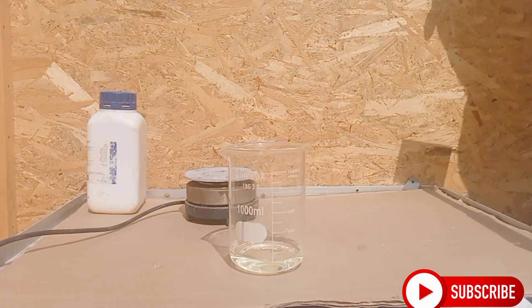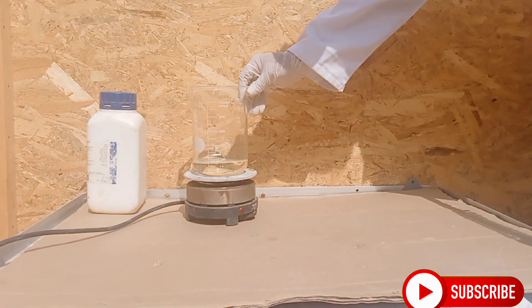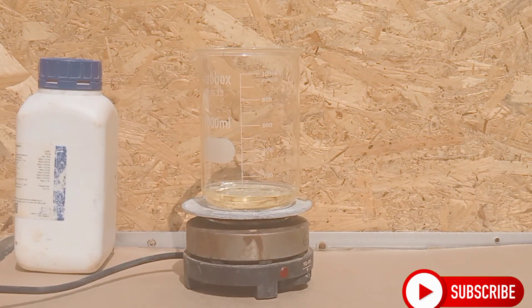All we need is bleach, an electric heater, two cups and a bowl of water. For reference, I used 120 milliliters of 12-degree bleach. Then we heat it up on an electric heater.